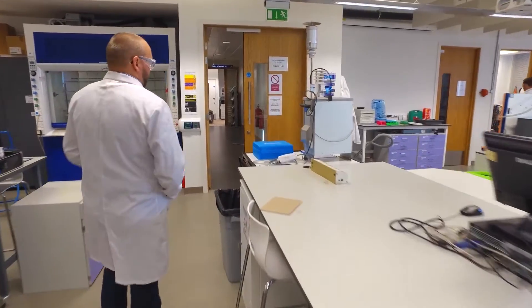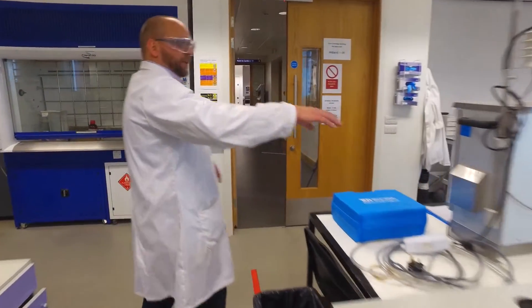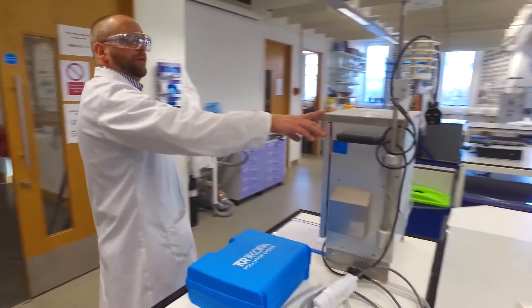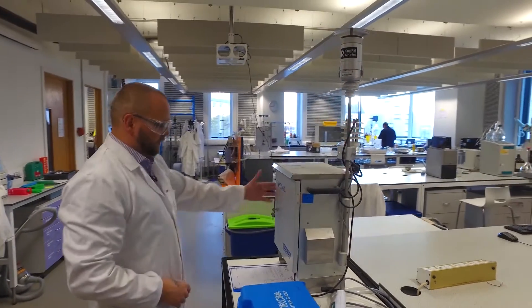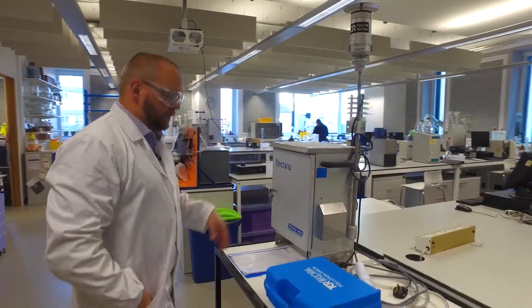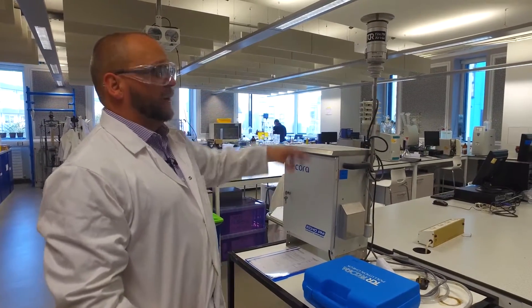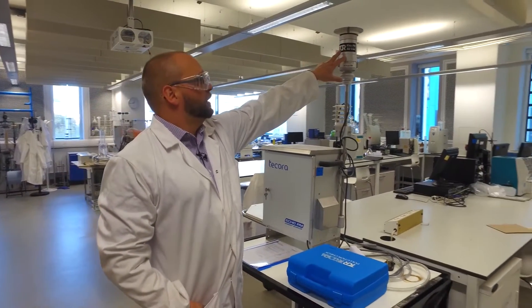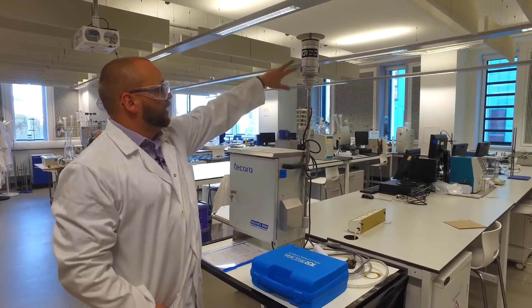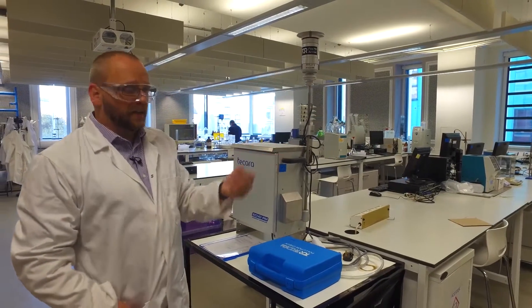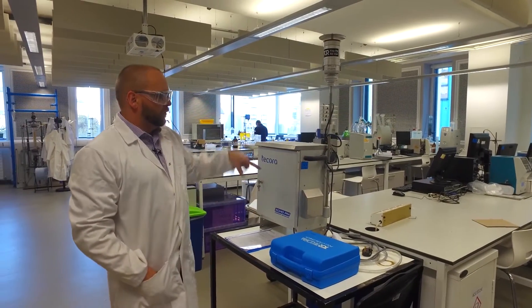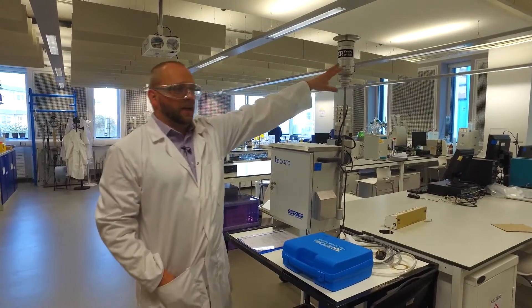This piece of kit that we keep walking past is an air sampler. In this system there will be a solid phase extractant and a pump. As you draw air in, your sample will pre-concentrate onto a particular solid phase extractant. You'll then take this away.